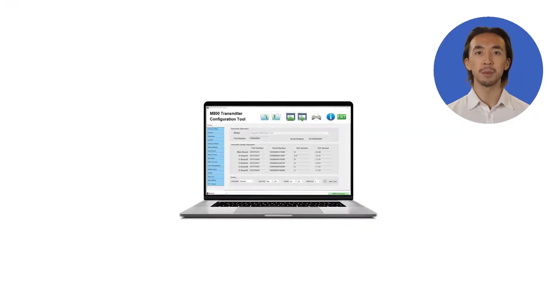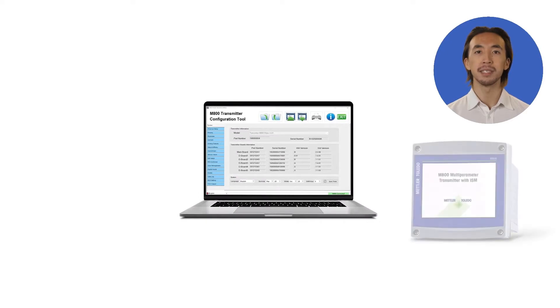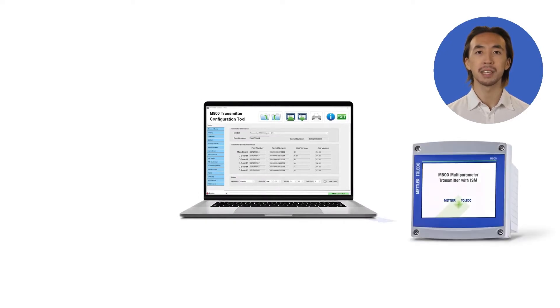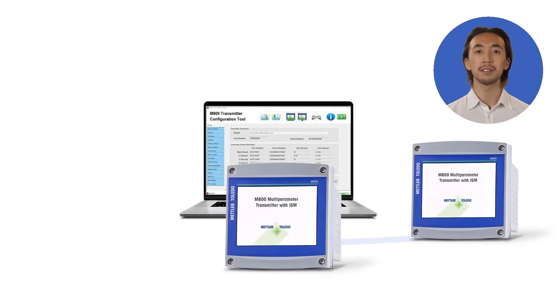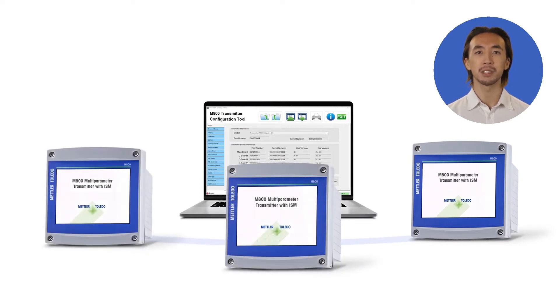Mettler Toledo Process Analytics can help you save time and effort in the configuration of your process transmitters, offline in a safe environment with the PC-based Transmitter Configuration Tool or TCT.